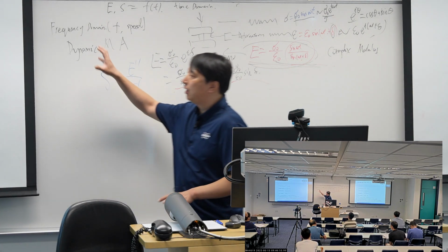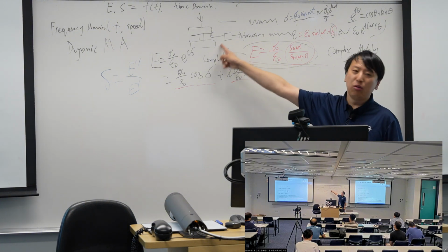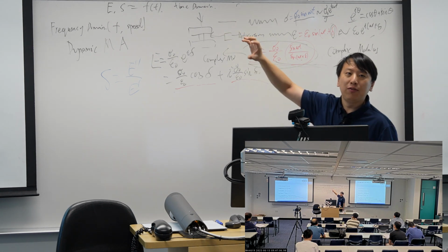So that's the classic DMA done. For the DMA, the experimental setup is something like this. Quite easy, quite easy. Of course, nowadays we do not use a camera to watch the deformation.